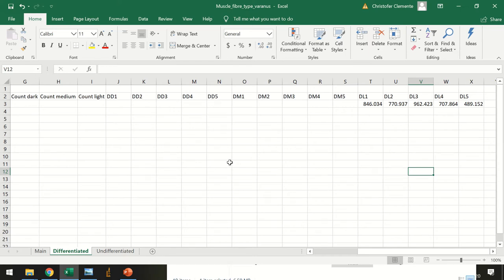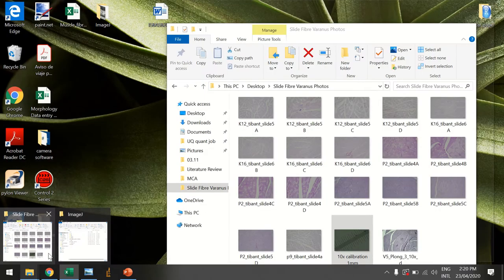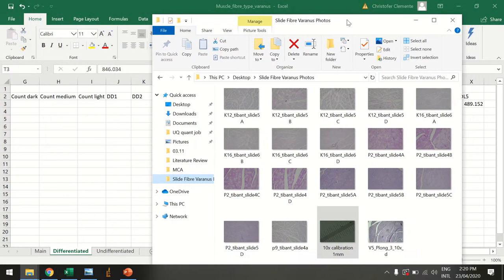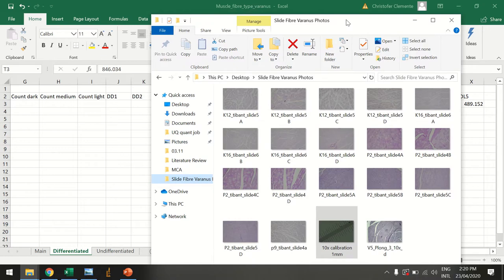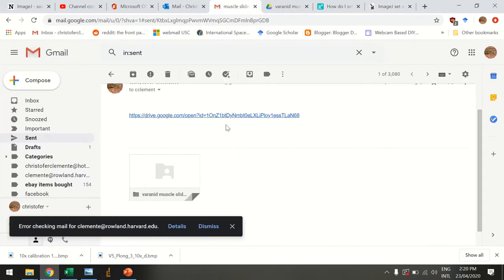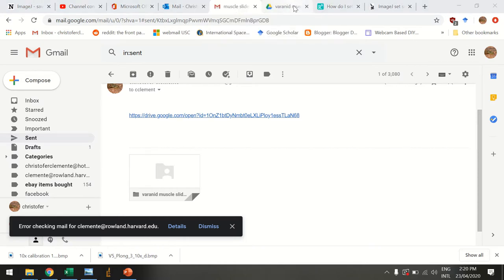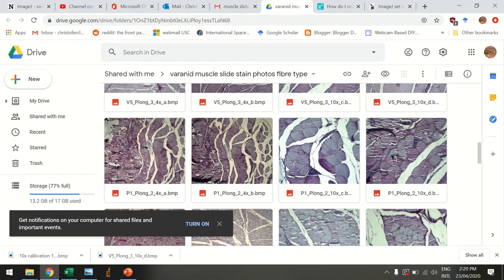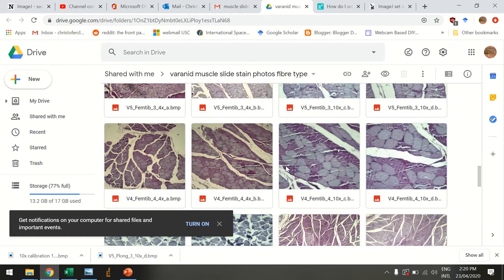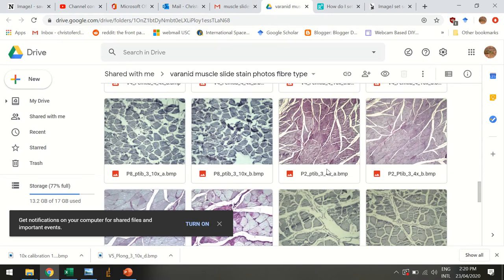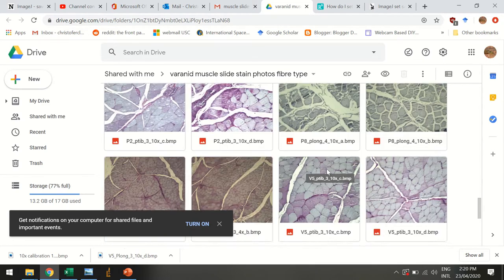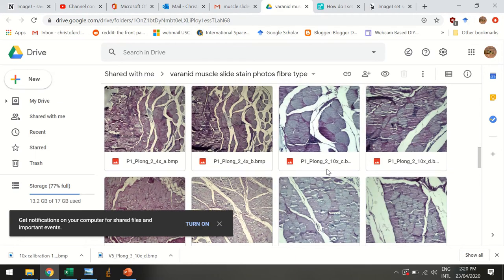Okay, so now we're going to work out how to get these diameters from these cells. We've been staining like crazy and we've now stained a lot of slides. They're all now available on a Dropbox folder here and you're going to see there's lots of different slides. Some are differentiated well, some not so much. A lot of the times we can see these three different cell types, so we're pretty excited about it.